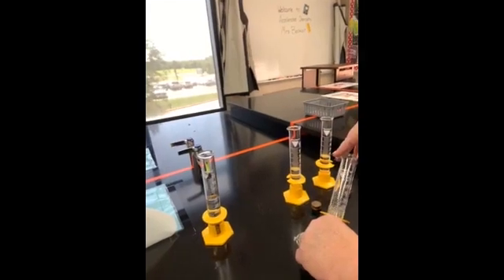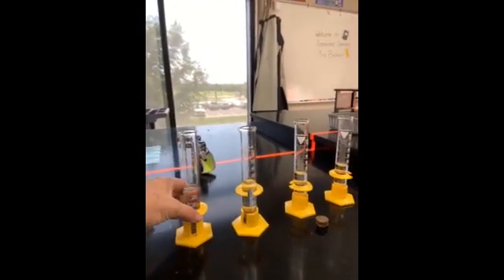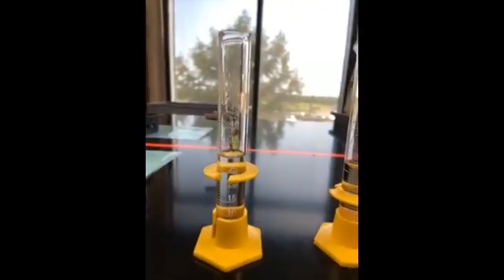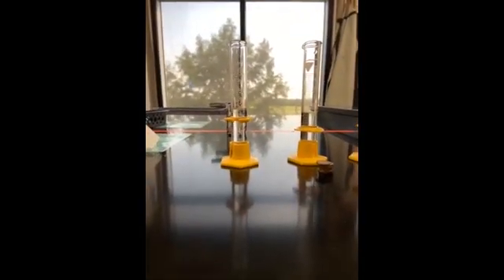We add our pennies, tip the cylinder. And now the volume, this is trial 2 for pre-82 pennies. This looks like 30.00 on the nose to me. If you read it a little bit differently, that's perfectly fine. You can use your measurements. I'm just telling you where I'm reading it.